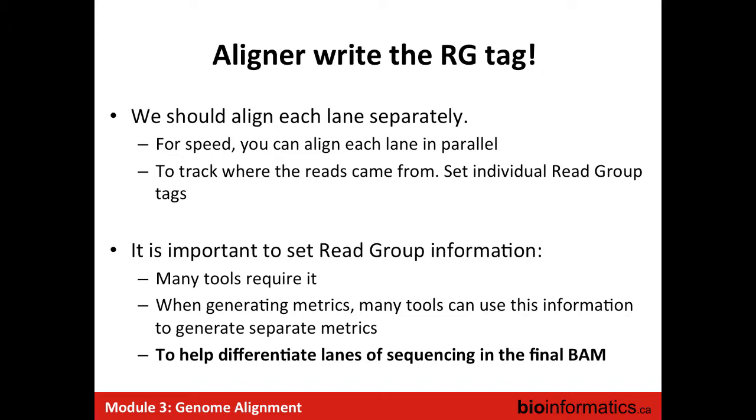Probably it's a library from another sample. So it's really important to be able to track back what you see at the end, using the read group. It's also really important because now many tools know the importance of the read group and will require that you have set up the read group.